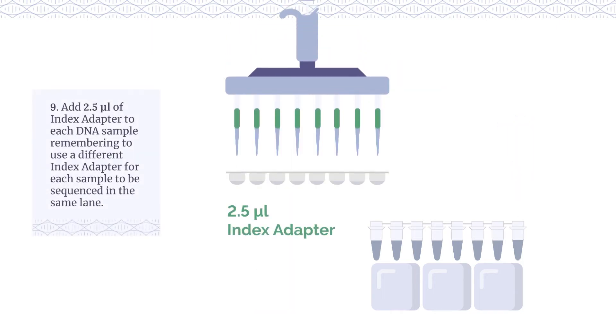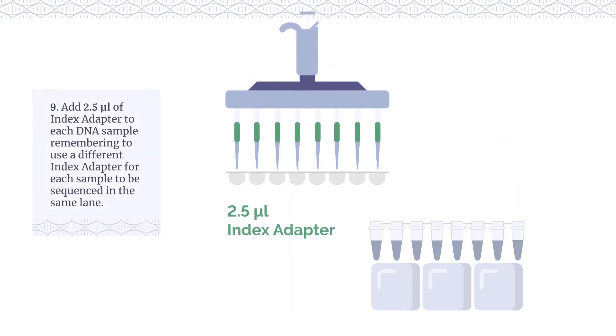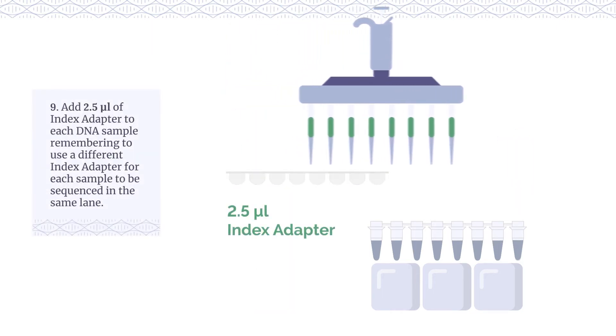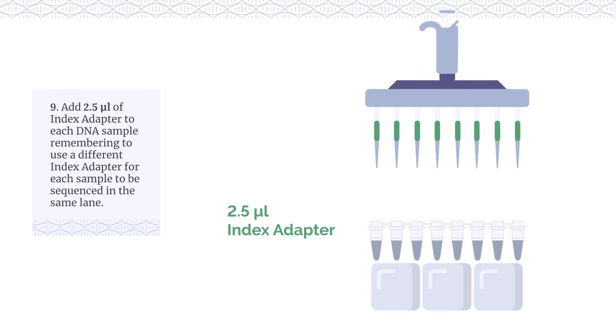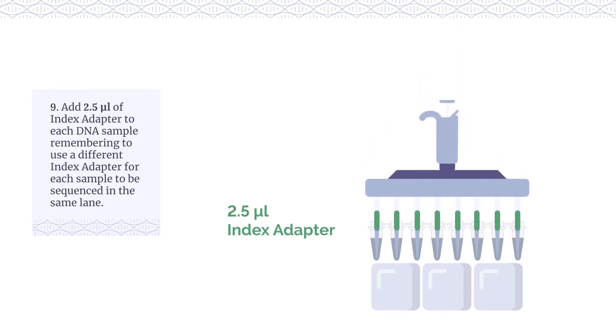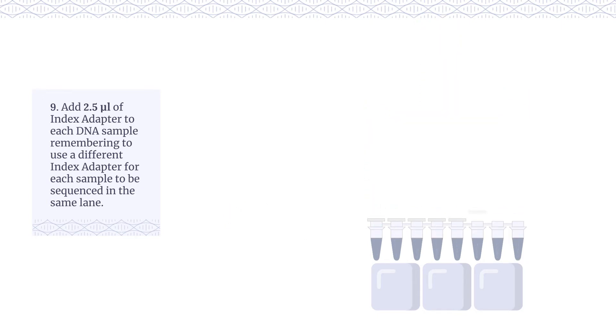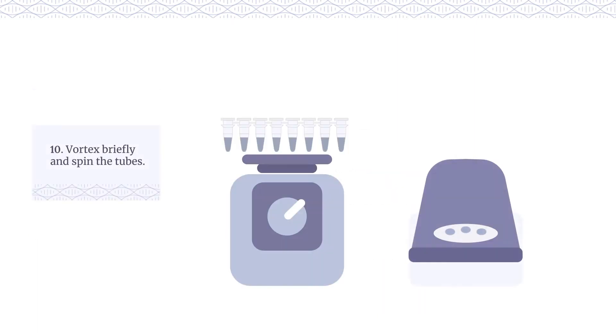Add 2.5 µL of index adapter to each DNA sample, remembering to use a different index adapter for each sample to be sequenced in the same lane. Vortex briefly and spin the tubes.